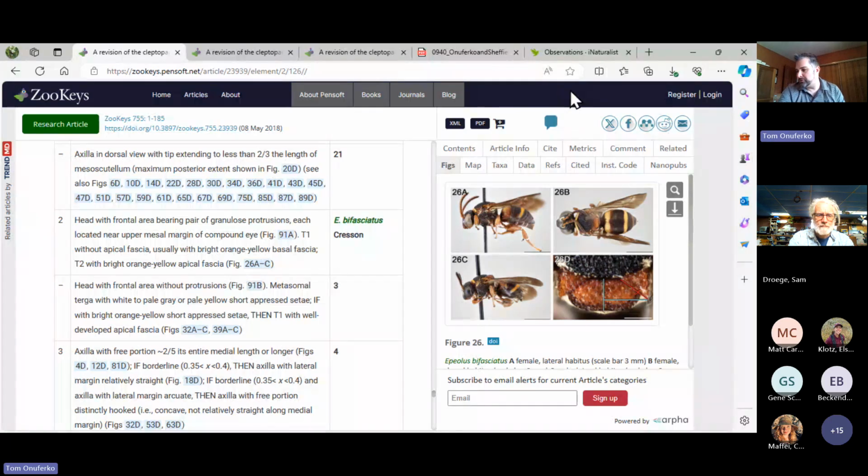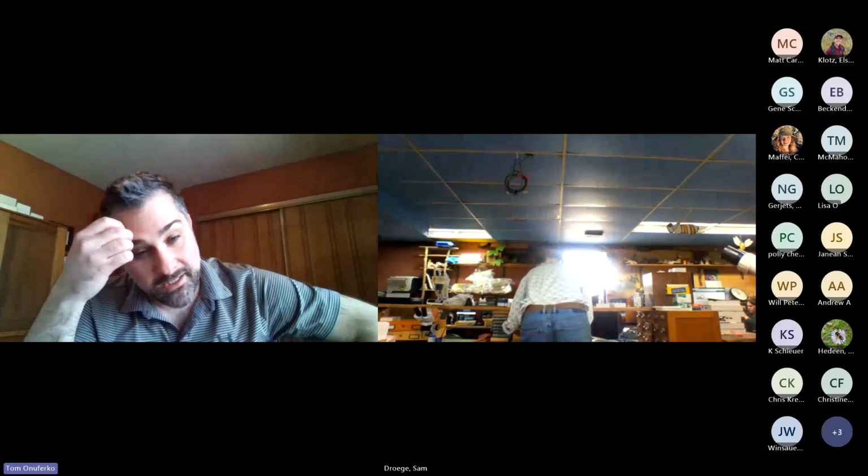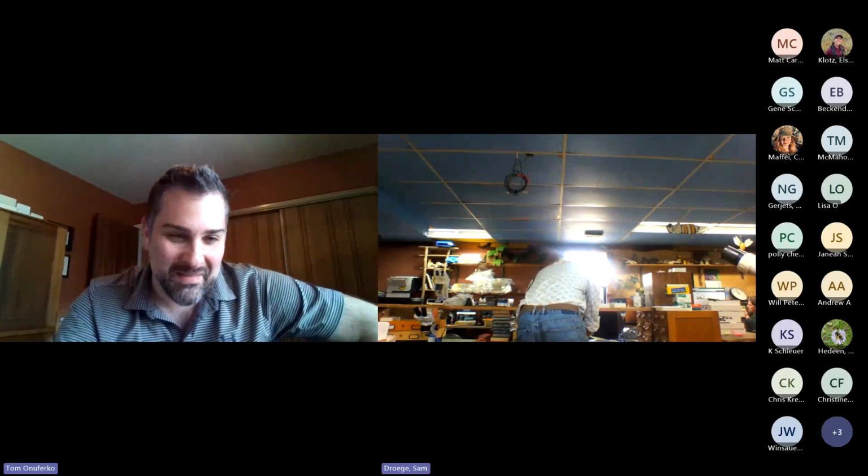So I don't know, Sam, if you want to pull the bifasciatus specimen back. Oh, you want scutularis back? Yeah, just to show that it doesn't have those features. Sorry, maybe it's better if you just keep it next to you. Keep it on deck. Yeah.